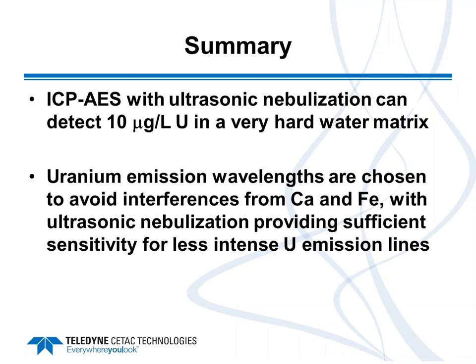In that case, of course, it depends upon the cleanliness of your reagents and your laboratory vessels, everything to achieve very, very low levels. There was one particular application that I can mention that was looking for very low levels of platinum group elements, particularly gold. But that has been done with the ultrasonic, probably more so in past years before ICPMS became very much more sensitive in recent years.